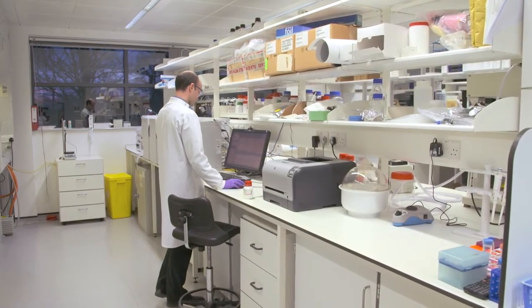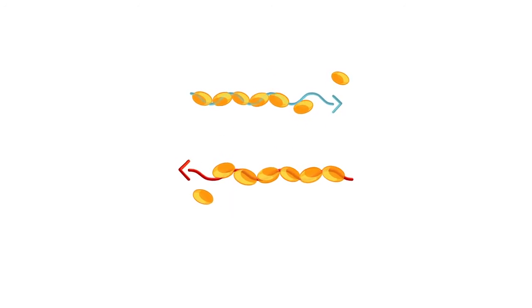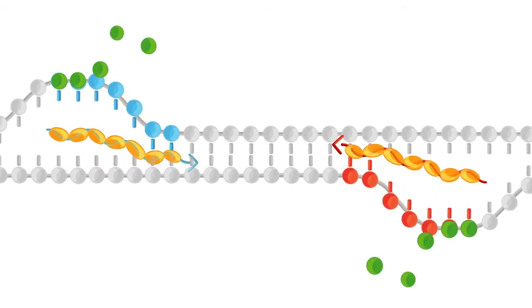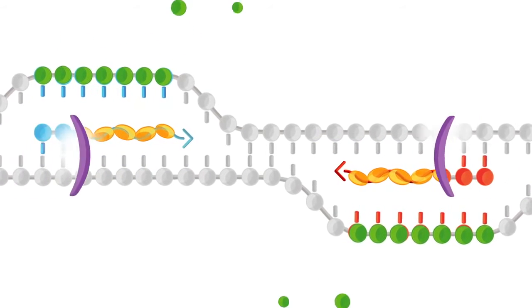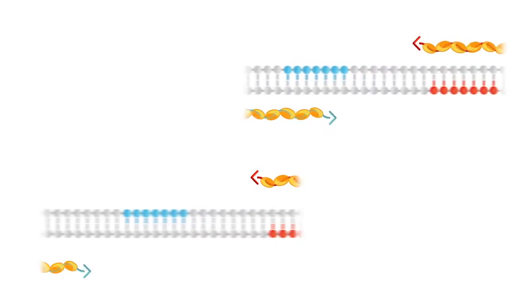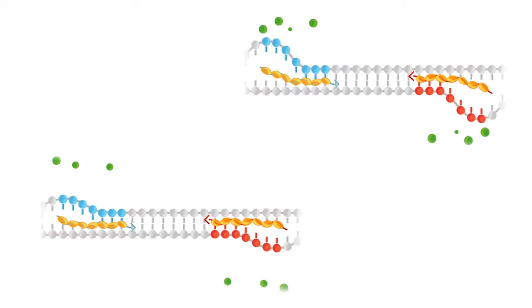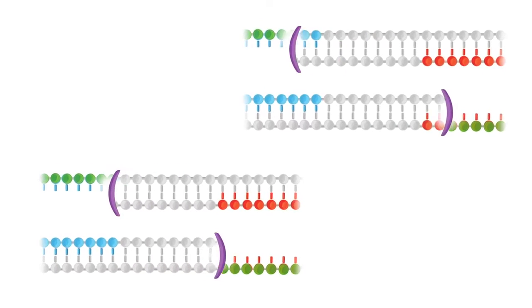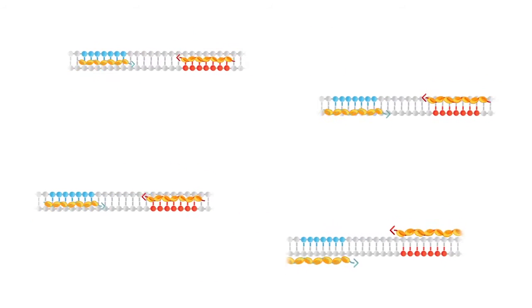At the heart of it is that RPA, in contrast to PCR, is an enzymatic method in which the thermal hybridization step that in PCR guides the oligonucleotide primer to its binding site in the template is replaced by a step that is facilitated by a particular enzyme, or what's called a recombinase, that interacts with the oligonucleotide primers and helps the primer to find its target site within the template.